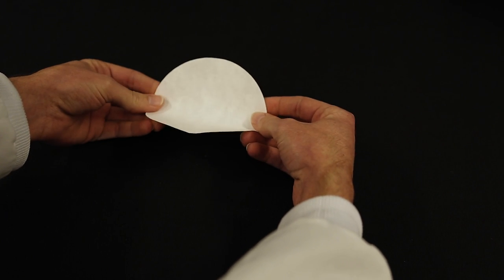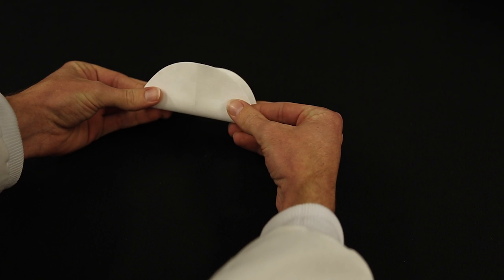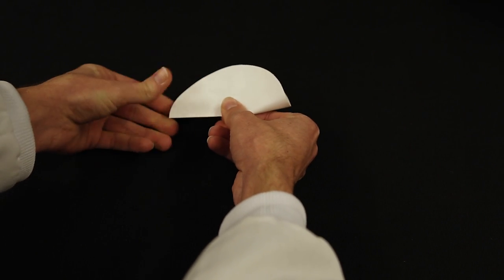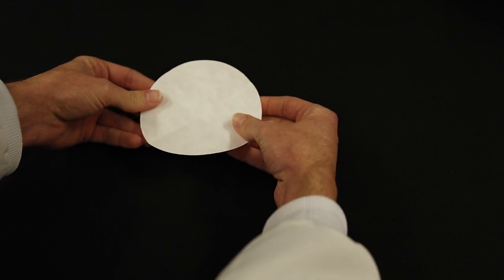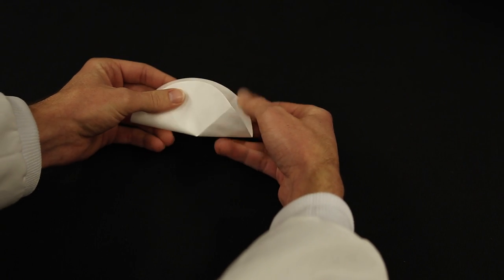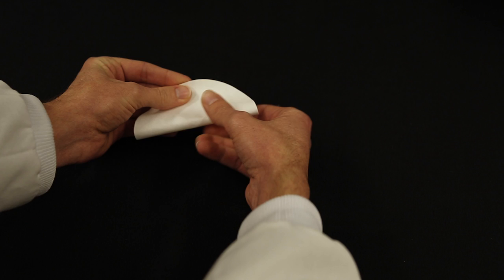Open it up and turn it 90 degrees. Line up the pleats that you just made and make another sharp crease. Open it up. Line the pleats that you just made. That will give you your third crease.